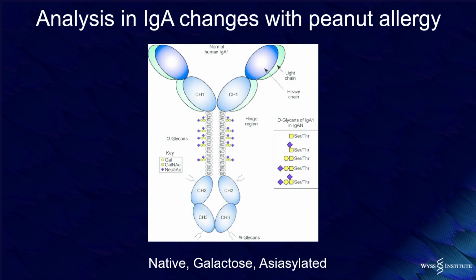Apparently, a lot of immune responses of our body to environmental stress is actually motivated and controlled by the IgGs and IgAs. In this particular project that I'm about to show you, we've been using the IgA that had been derived from the kids who have allergies to peanut, and there is a variety of the responses from the very light to very heavy, and apparently they've been separated, as well as of course control from the kids that do not have an allergy and enjoy peanut butter each morning.